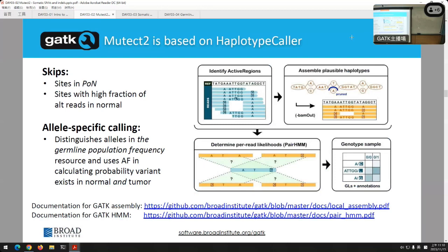Again, the idea is that we want to be very sure when looking at the somatic side, because of the noise, that what we're seeing is real. But on the germline side, sometimes you have low coverage. So there are things that complicate the quality there. We're fairly permissive. If we see something over there in combination with our background frequencies, we're more likely to give it weight here. It's different than the normal haplotype caller, okay? And the idea is, again, minimizing false positives.